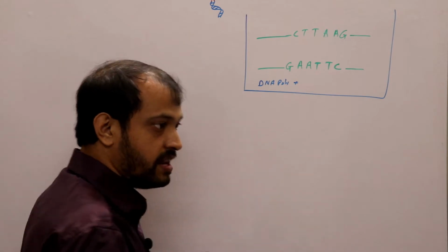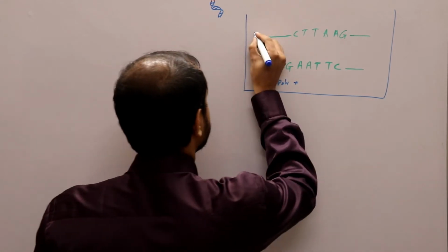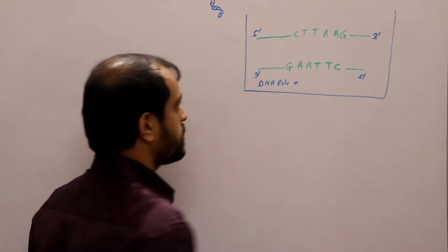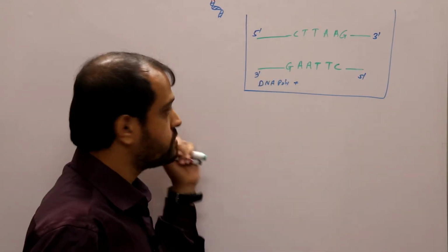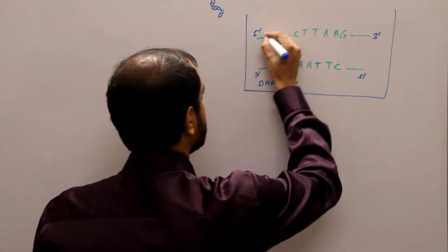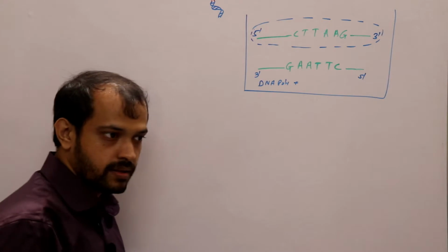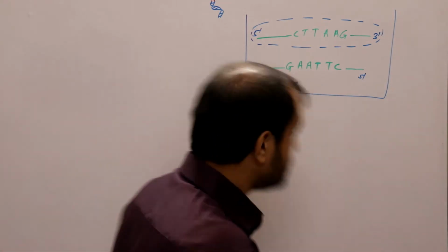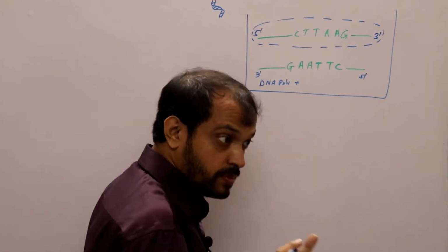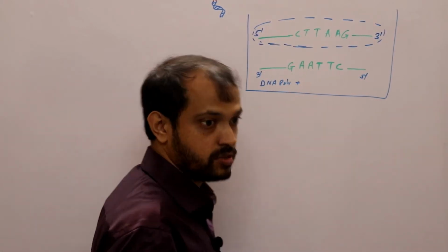Suppose in a confidential meeting we have decided that there are two strands of a DNA, and we will sequence this particular DNA strand. Then reading this we will understand how to do this. Now listen. So we are assuming that we will be doing the sequencing of this. Both can be done. Yes, it's a laborious job.